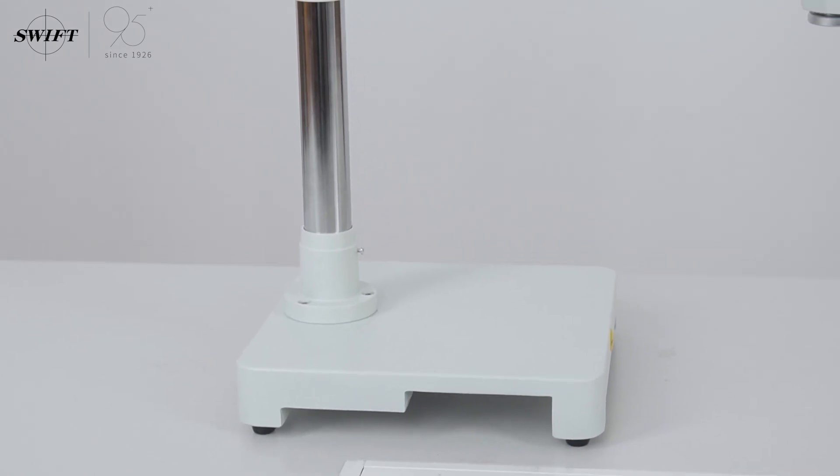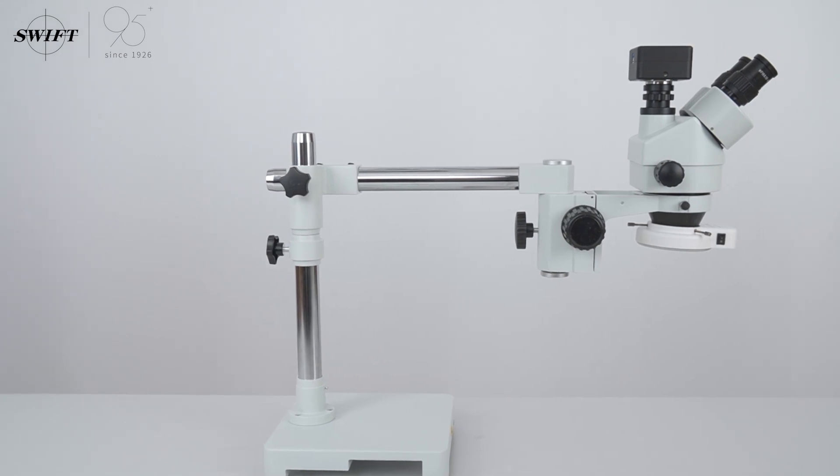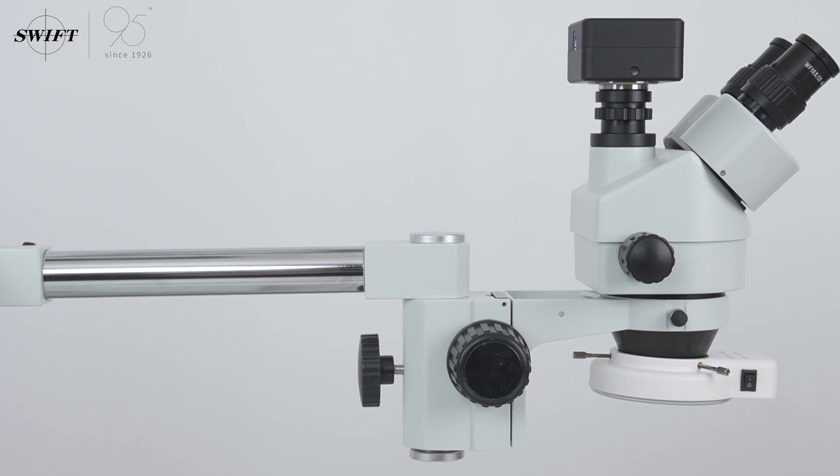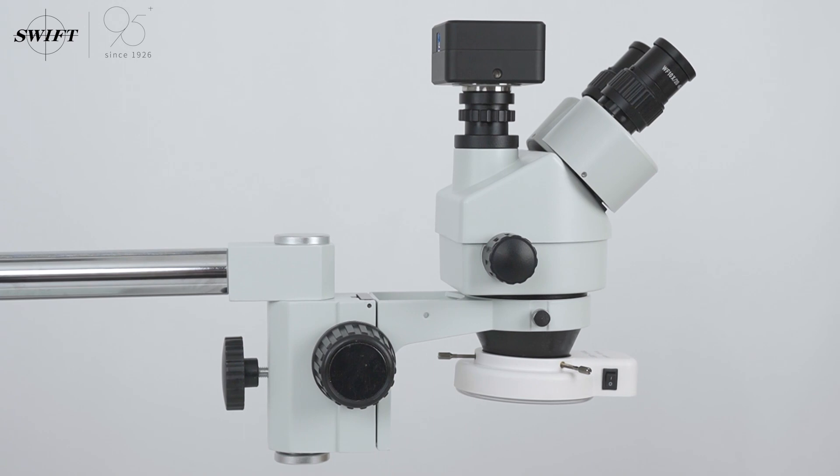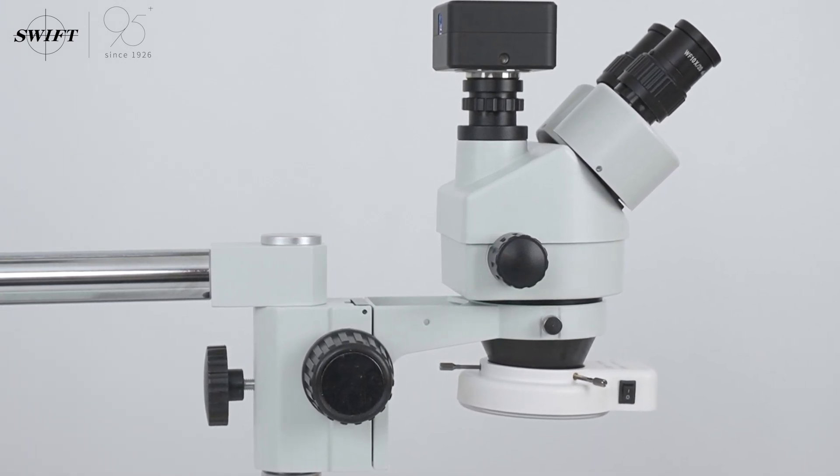The horizontal column, which is installed on the vertical column, can be retracted forward and backward. The frame body position allows 360-degree rotation for wide-range observation, especially for large objects. It is more convenient to observe length, width, and height.